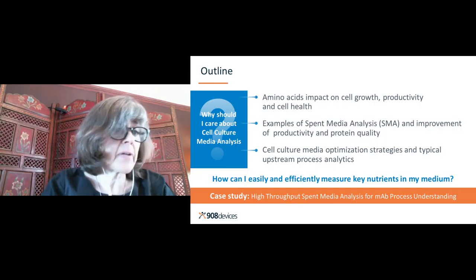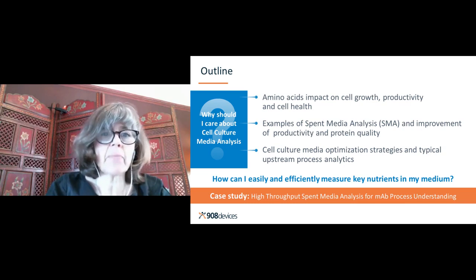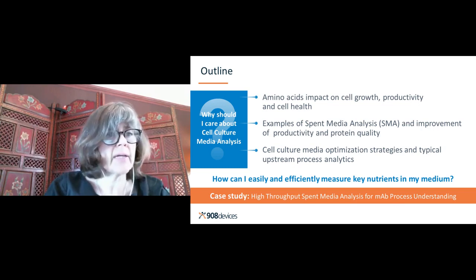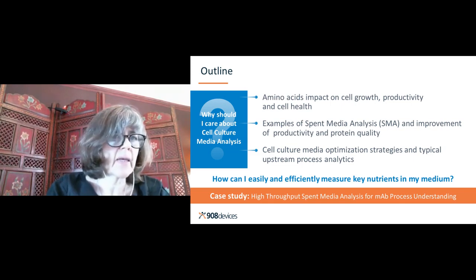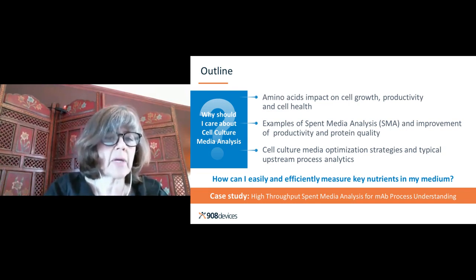So why should we care about cell culture media analysis in bioprocessing? We'll talk about the amino acid impact on cell growth, productivity, and cell health. And I will start to shed more light on why we should care about cell culture media analysis. We'll see some examples of spent media analysis and improvement of productivity and protein quality. And then we'll talk a little bit about cell culture media optimization strategies and typical upstream process analytics. And you may wonder, well, how easy is it to measure key nutrients in my medium? And I will answer that question. We will then finish with a high throughput spent medium analysis case study for mAb process understanding.